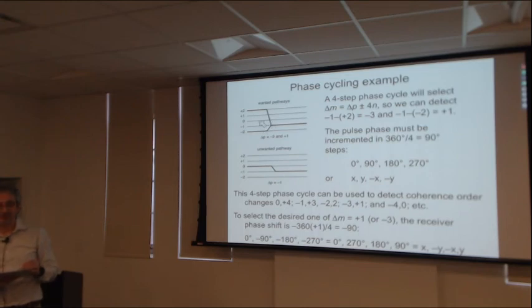And I don't need to worry about it. So I might be able to shorten the pulse sequence, the phase cycle, by thinking more carefully about what's actually happening. This is guaranteed to work, but it might generate too long a phase cycle to be practical.